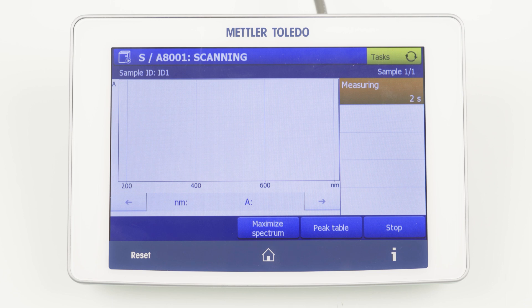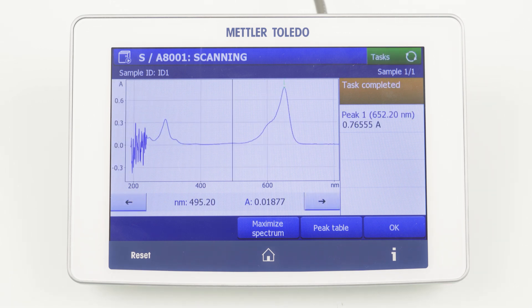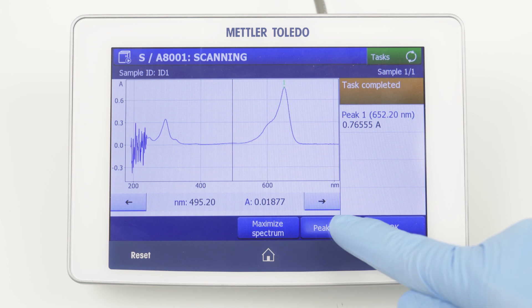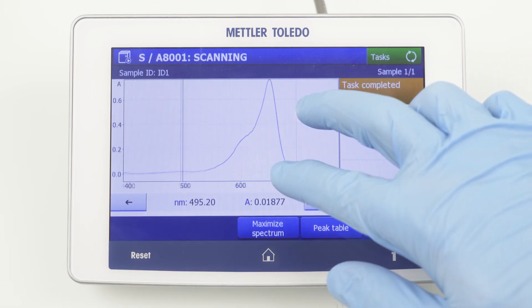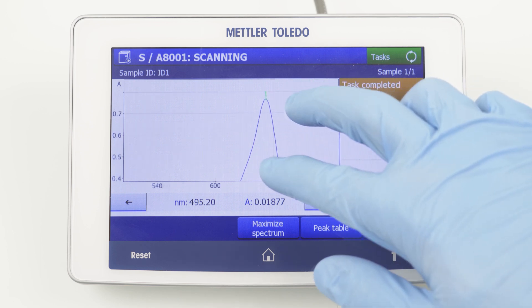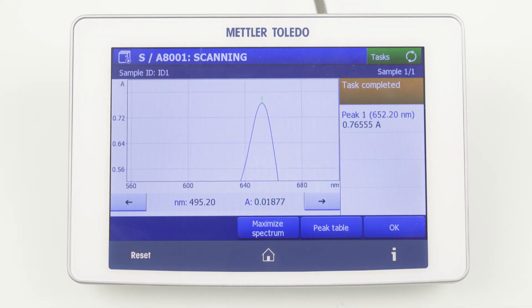The full spectrum is shown on the screen and the detected peaks in the region of interest are labeled. By clicking on the peak table, the list of all found peaks is shown. You can also zoom into the spectrum with two fingers and return to the default view by a double click on the spectrum.